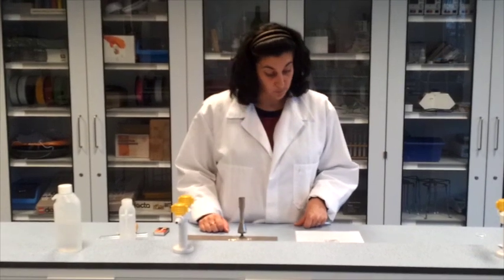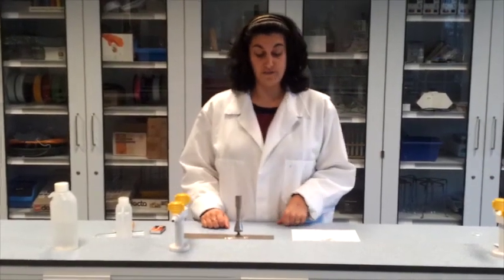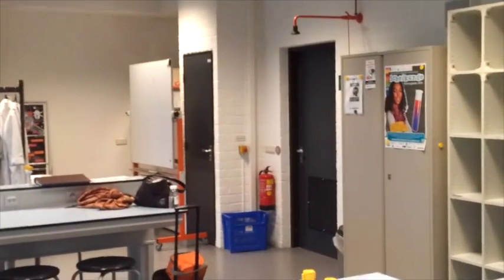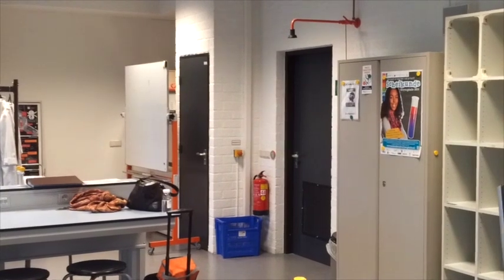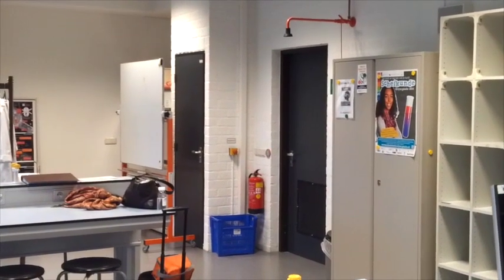First of all we need to check the safety measures. We need to check the location of the fire extinguisher and the shower. In the science lab they are over there and in room 101 they are also just by the door. We also check where the fire blanket is in case someone catches fire.